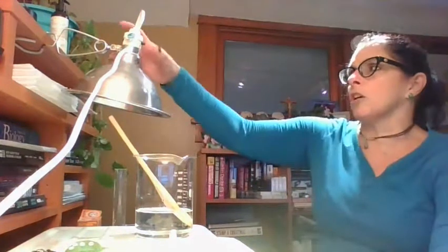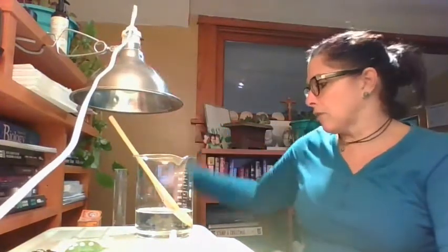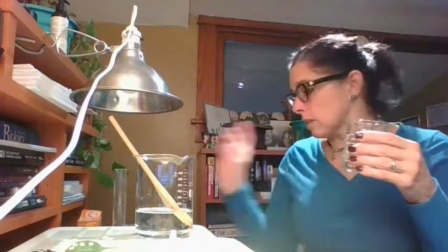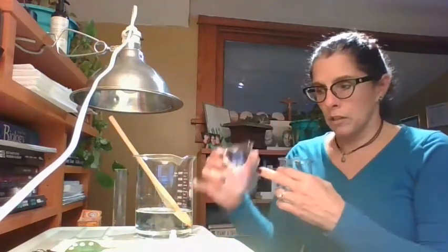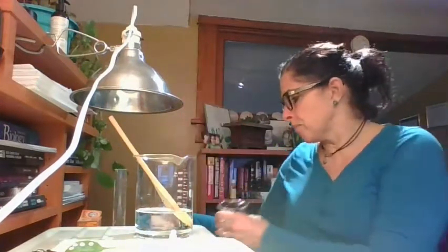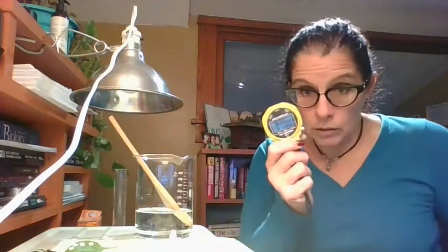So the lamp is going to be turned on, and then I'm going to have 2 containers, one with this stuff and 10 leaf discs, and one with this stuff, 10 leaf discs, and my variable. And turn the light on. Timer. You guys, this is the part that you guys are going to do. I'm going to time how long it takes for them to float to the top. So that's this first little experiment, the introduction to the experiment.